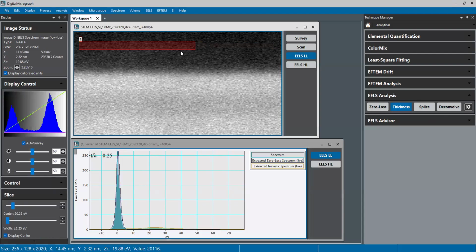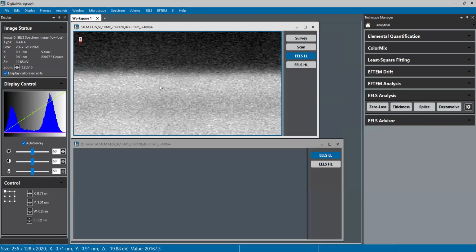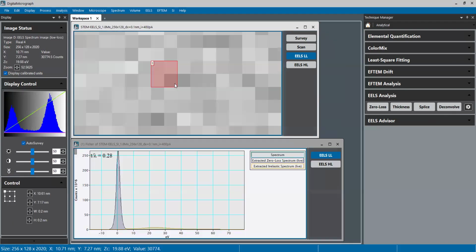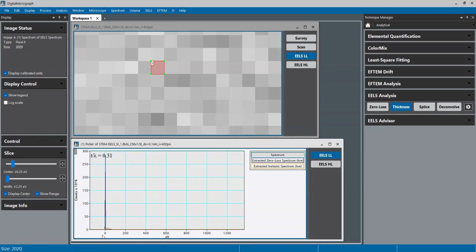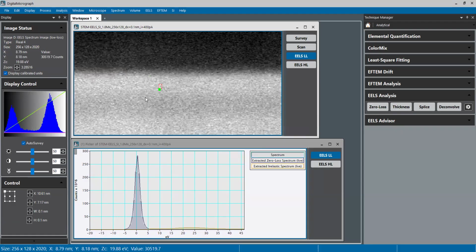And of course, I can make this down to just one bitty pixel here. So actually, let me digitally zoom in here so you can see, right? That's just one pixel at that point, okay? So, do this home display. There we go. Okay, so let me double click, there we go, to send it back.